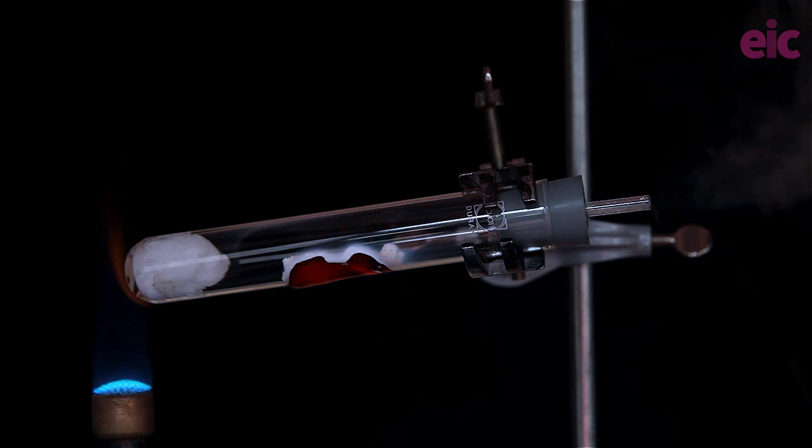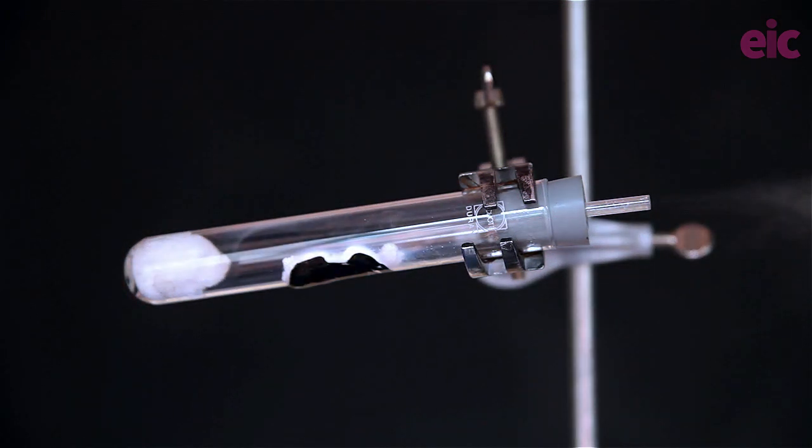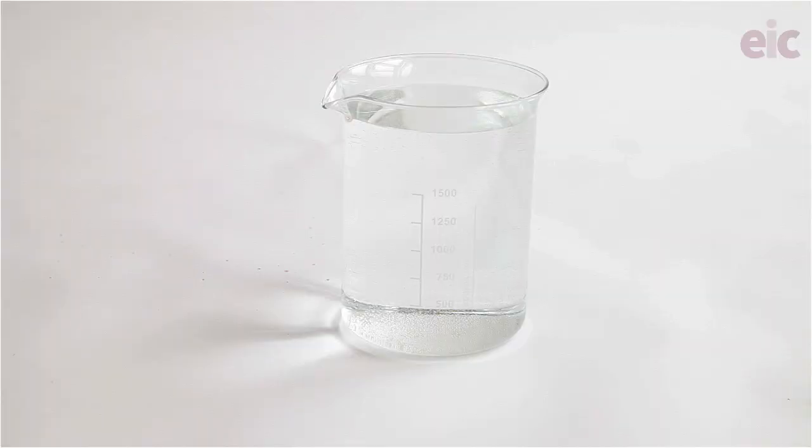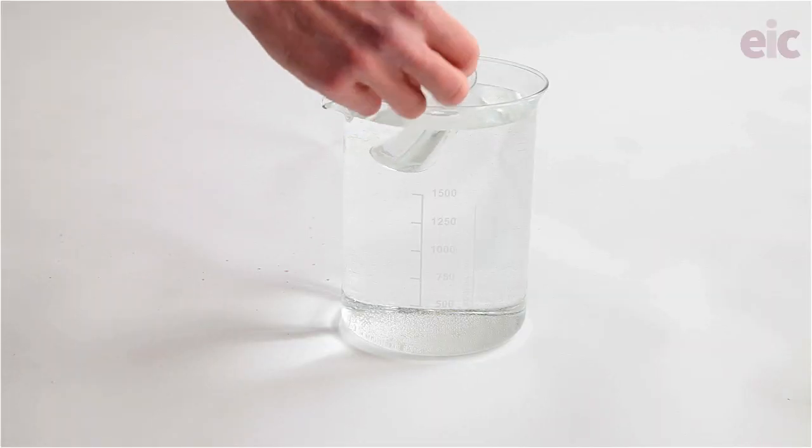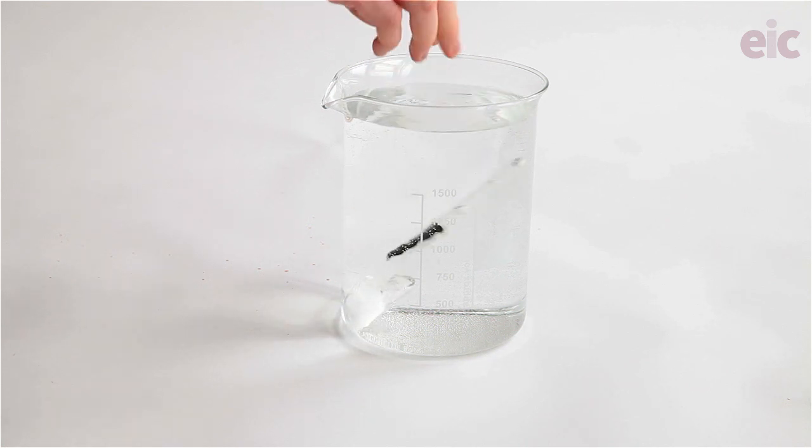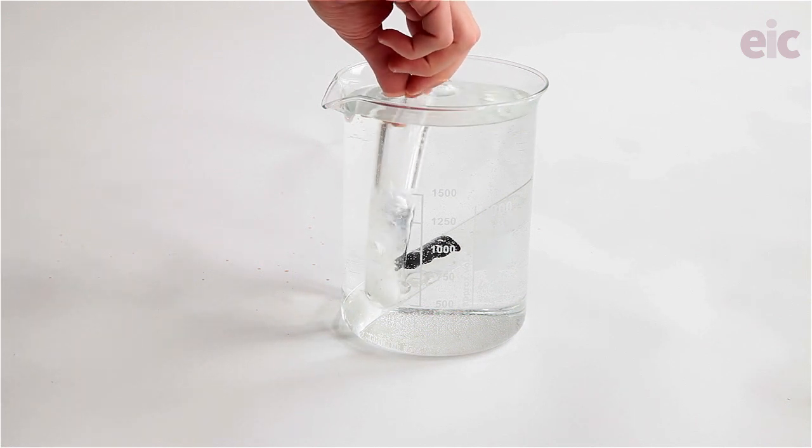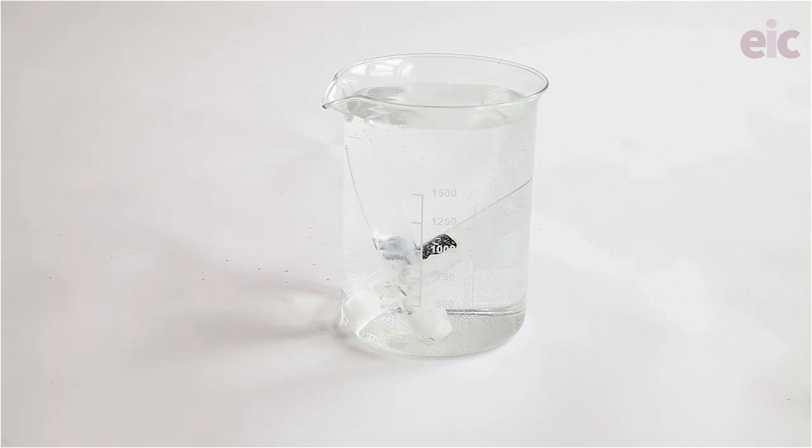Sometimes once you finish the experiment you'll notice the borosilicate tube will crack. Even if it doesn't the glass will still be severely weakened and should not be reused. Rather than reusing it, rinse in at least 500 cm cubed of water. You might get a few bubbles or even a pop as magnesium silicide reacts to produce pyrophoric silanes and then you can then dispose of this in your regular glass disposal.